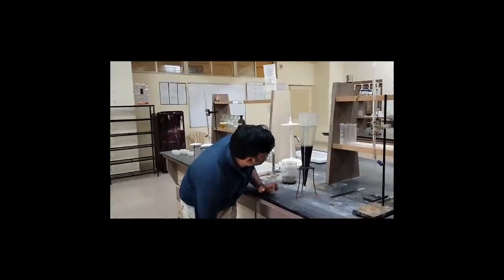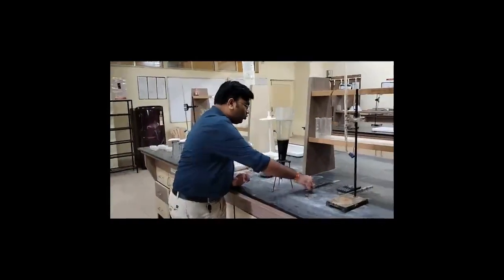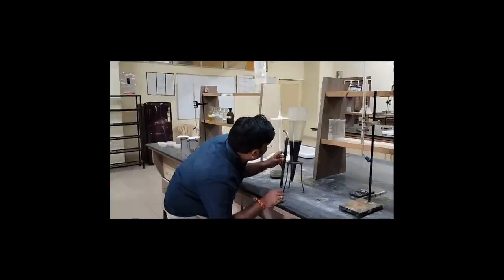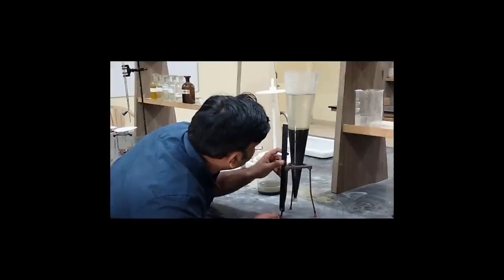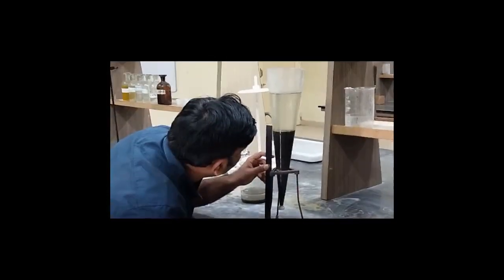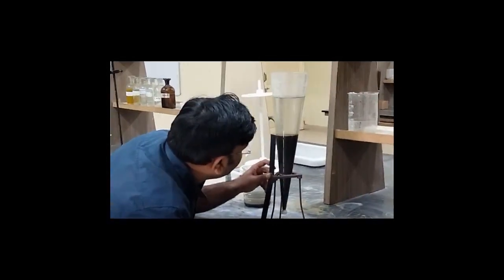If you see, now particularly it is slightly below the 350 ml mark, right? So how to measure this? We'll have to take a scale, and with the help of interpolation we can measure this. From 300 to 400, it is approximately 2.7 centimeter, right? So it is 2.7 centimeter for 100 ml, and hence we can measure this as well.